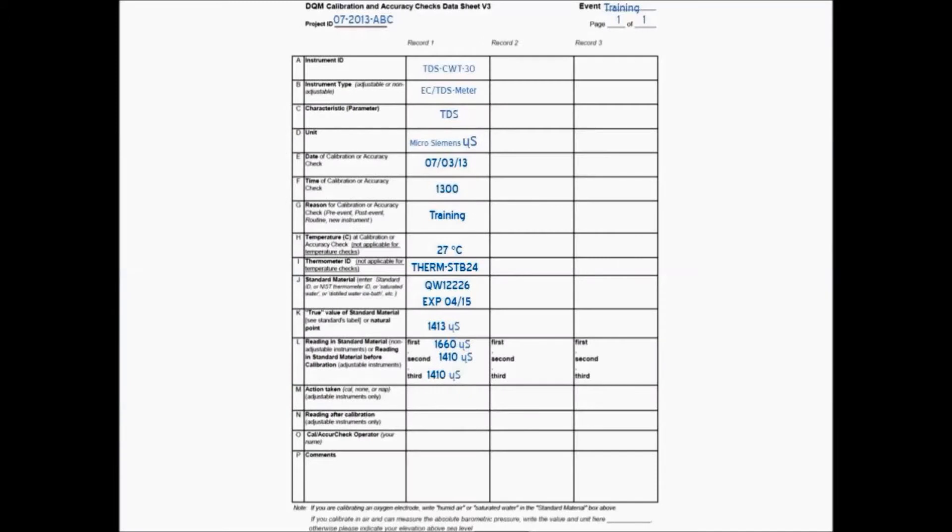In our calibration spreadsheet for action taken, we'll be writing in 'calibrated,' and we record the meter's final reading after calibration. Make sure to record the name of the person who calibrated the meter, and any additional comments.